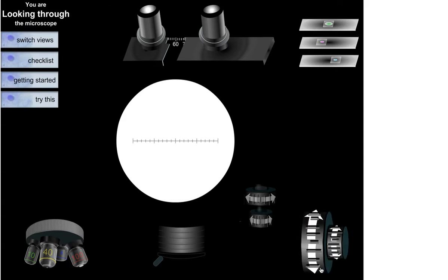There, we saw it. We went too fast. Okay, there it is. Okay, that's good. And so we want to move the E to right in the center, so right around here. So we're just going to move a little bit back and forth. So it takes a little bit of time to get used to.